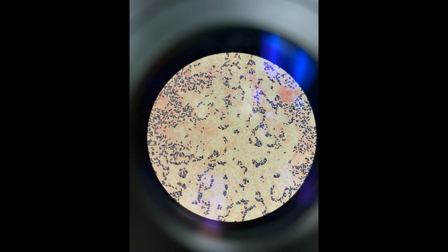So I know that in the video when I was preparing my Gram stain, I told you I was going to do 1 gram-positive, 1 gram-negative, and 1 mixed culture, and that I would show you those under the microscope. But I was so proud of my mixed culture that I said, forget it. I'm not even going to show them my single cultures. You've already seen a direct stain of what crystal violet looks like, so you know they're going to be purple. You've seen a direct stain of what safranin is going to look like, so you know it's going to be pink. But I was so proud of this Gram stain that this is the only thing I decided to show you.